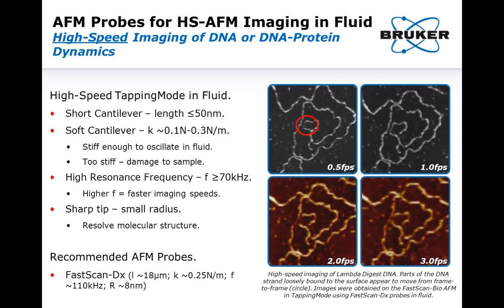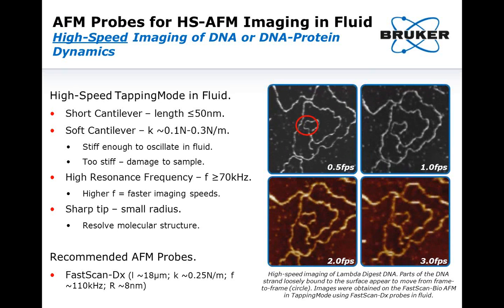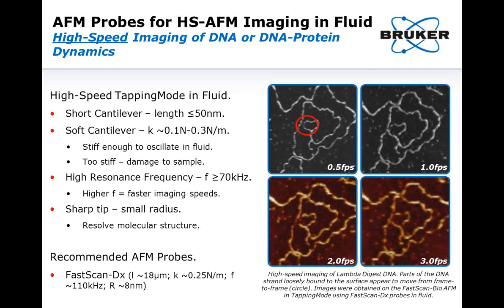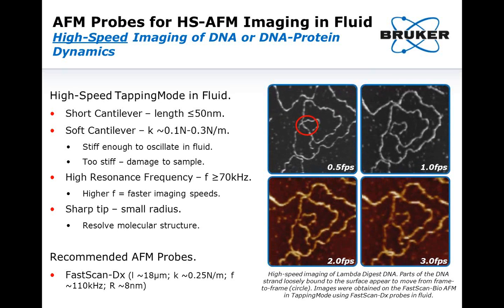Again, we're using a short, soft cantilever with a high resonant frequency and a very sharp probe. The probe sharpness is required to resolve the molecular structure, and the high resonant frequency permits the fast image acquisition, and the short cantilever provides the force sensitivity required to preserve the sample.